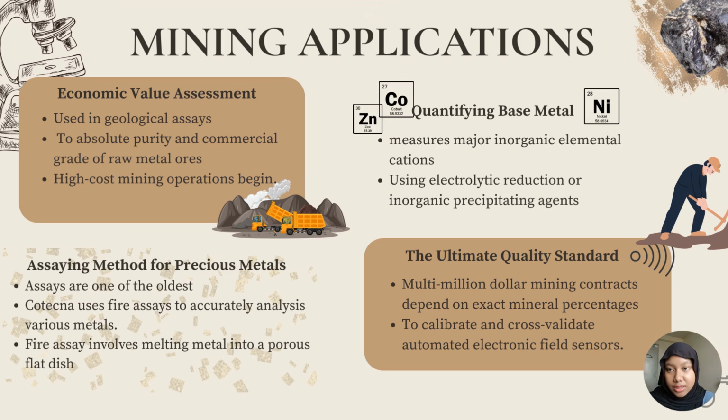The last one is the ultimate quality standard. Multi-million-dollar mining contracts depend on exact mineral percentages. Gravimetric analysis's unmatched physical accuracy makes it the definitive reference standard used to calibrate and cross-validate automated electronic field sensors.